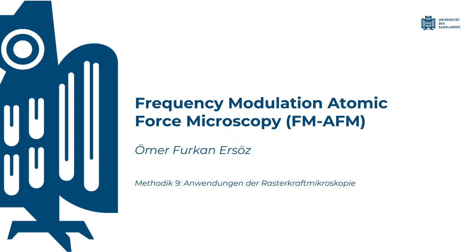Hello everyone, I'm Ömer. In this talk, I will give an overview of frequency modulation atomic force microscopy, or FM-AFM, and its significance in nanoscale materials characterization. We will explore how it works, why it's used, and where it provides a unique advantage in material science.